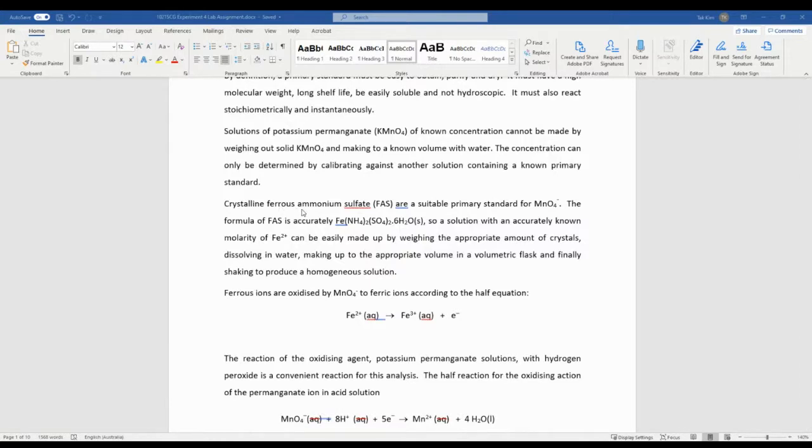Since we are asking for exact molarity, you'll need to use a 4 decimal place balance to start with, and then you'll need to use a volumetric flask to find the exact volume. By using the exact mass, you should be able to convert into the number of moles, and then using the exact amount of your water, you should be able to calculate the exact molarity of your standard solution.